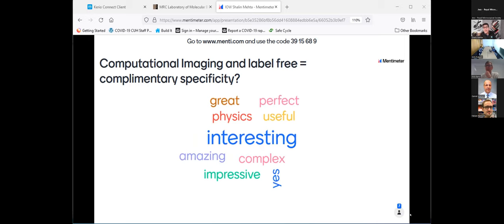While we're waiting, I'll answer one question. What is the tissue slice thickness? And the thickness up to which these methods can image, they are the same as confocal. All of these methods are limited by the scattering. And so it really depends on the sample. In the brain tissue, that's about 50 micron. In zebrafish, we can image up to the depth of 200 to 300 micron.